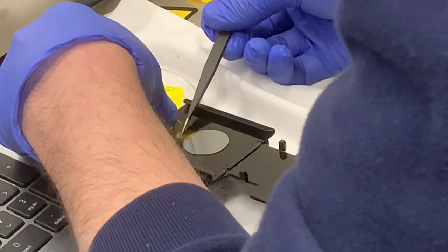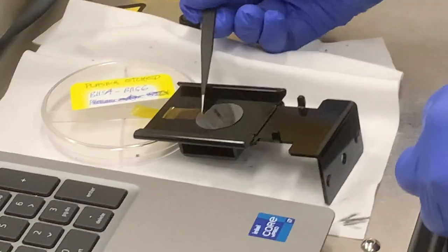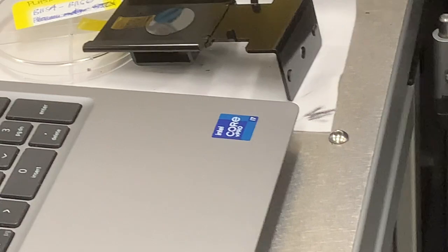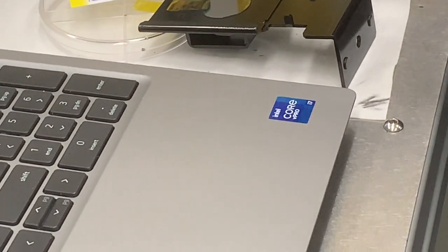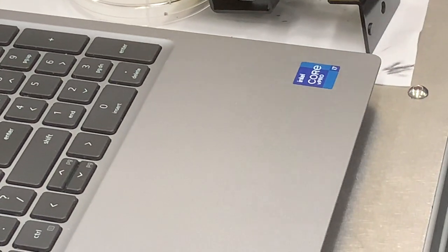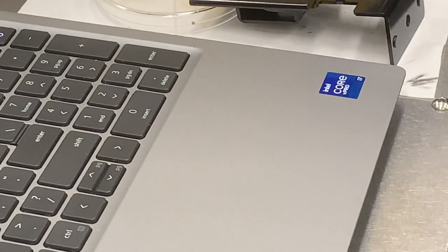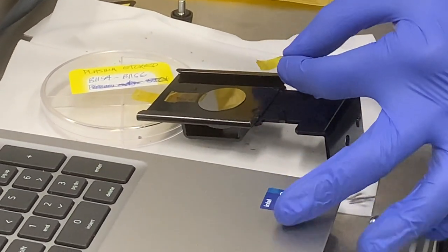So now you're filming preparation of sample. Yeah, so sample preparation. If our sample doesn't stick or doesn't stay stable on it, what type of tape is that? It's the masking tape we're using during the sputtering. It's a special kind of tape that can actually resist up to 200 degrees. Interesting.